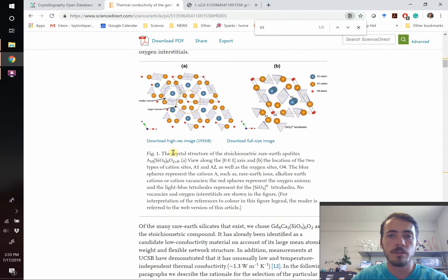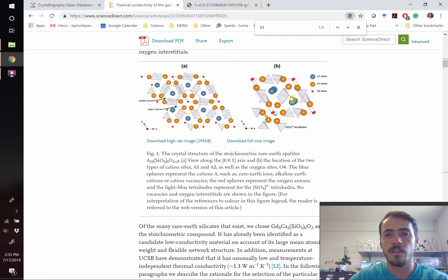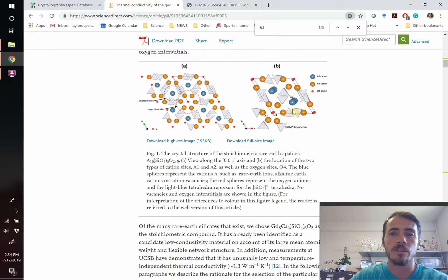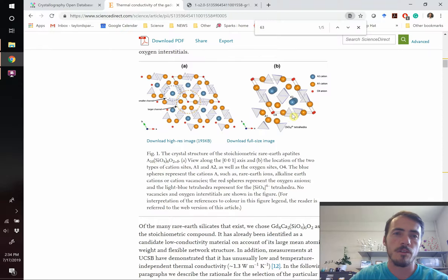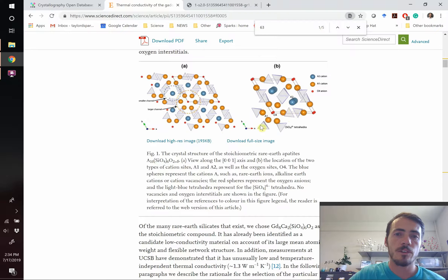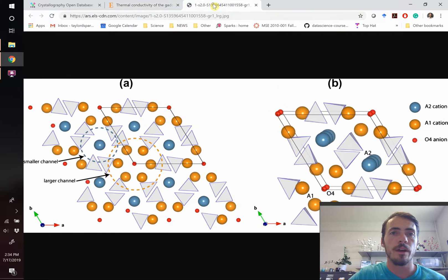And for us, it was important because we were talking about these different cation sites, the A2 site, that's this blue one, the A1 site, that's this orange one, and the oxygen sites as well as the silicate groups. It was important for us to differentiate the impact that these different sites were having on conductivity. So a nice figure helped us do that and this is what we ended up with.